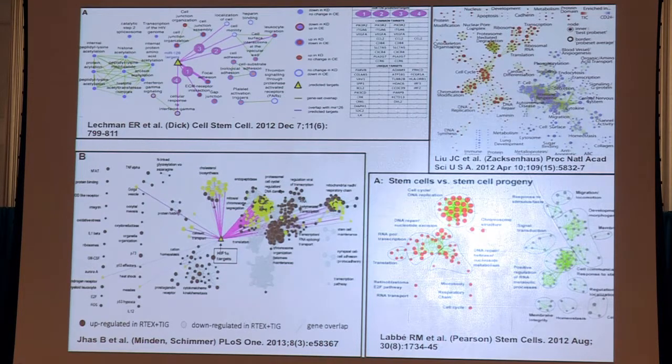I forgot to mention one thing earlier, as I'm mentioning hypotheses. The power of pathway enrichment analysis and the visualization method that I'm talking about is really to help sort through a lot of data and identify certain hypotheses that you might want to follow up on. So you want to get from a lot of data to some specific hypothesis as quickly as you can, although sometimes you can get very specific mechanistic hypotheses.